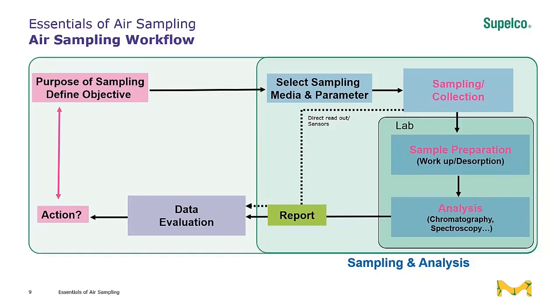At the laboratory, they perform what's called a workup or desorption procedure for those samples that require desorption. And then after desorption or any other preparative steps, the sample then goes into an instrument for analysis. Most often, the analysis is by chromatography or spectroscopy.